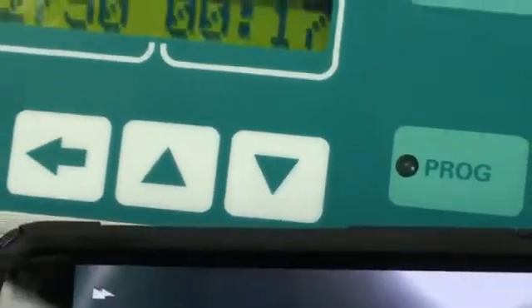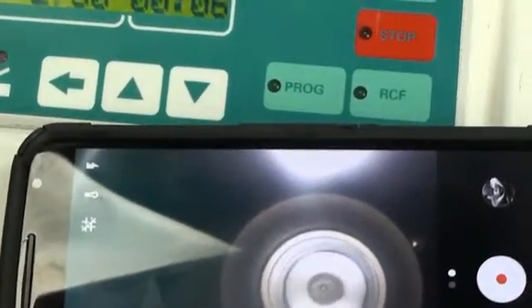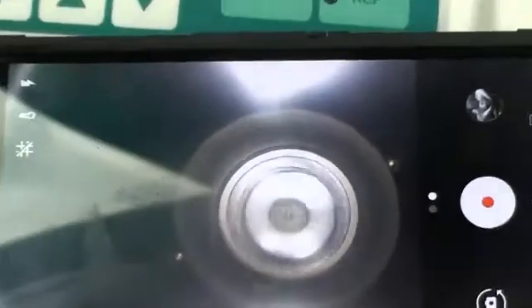Alright, it's beginning to slow down in about 20 seconds. Okay, now we can see how it stops — 3 seconds till... alright, it's stopping slowly. There we go.